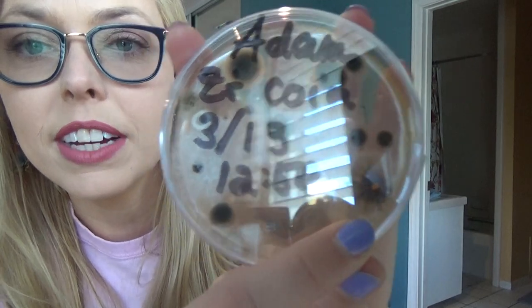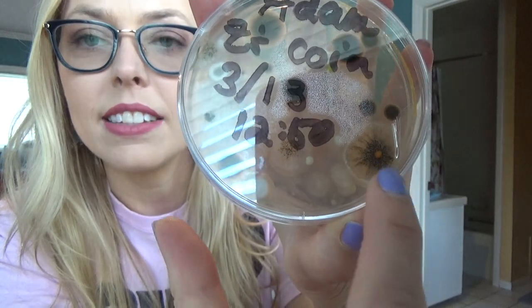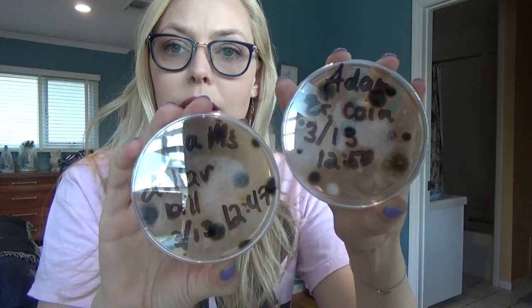They're saying right now that using a card is better than using paper money because you don't know where that money has gone — this might be part of the reason why. Now let's look at the coin. The bacteria on this one is really interesting looking: it's got a lighter border around it, then a dark spot, and then an orange spot in the middle. We've also got some other white spots and some fluffy white stuff growing. We did get a lot on the coin — the dollar bill probably has a greater spread of bacteria, but the coin looks like it has more colonies.